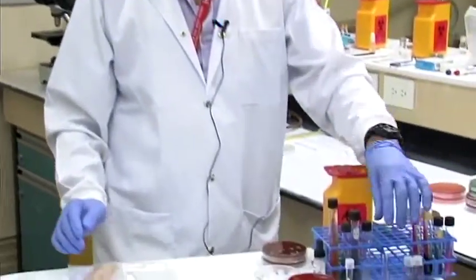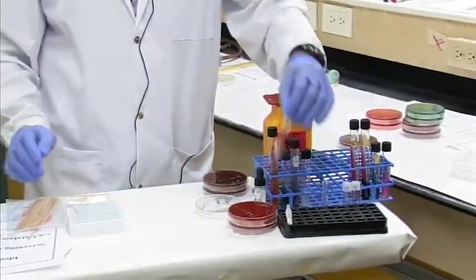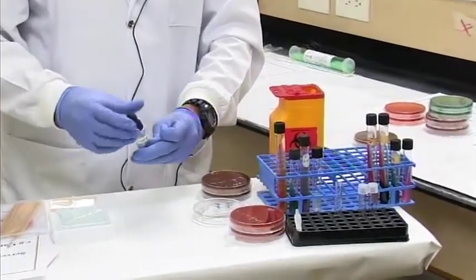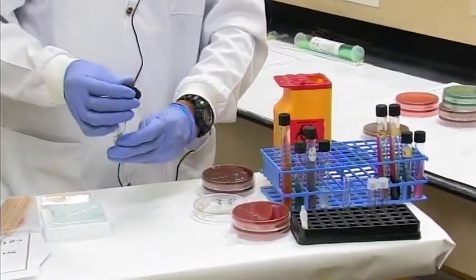So we're going to demonstrate now how to do your catalase test. What you'll need is a test tube, where we place some hydrogen peroxide for safety.